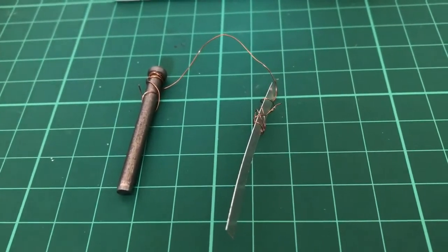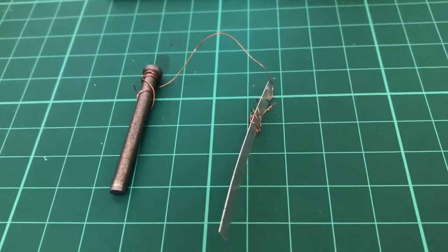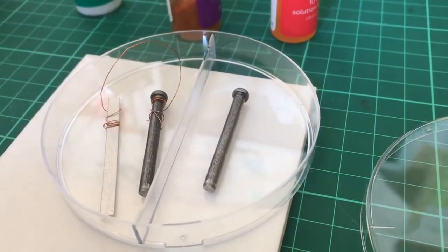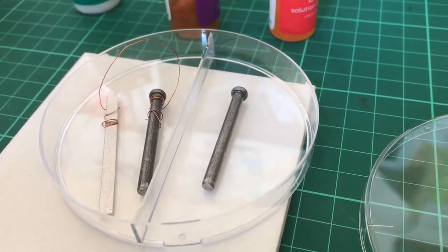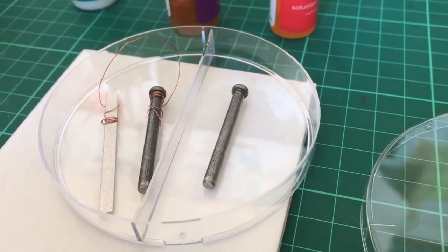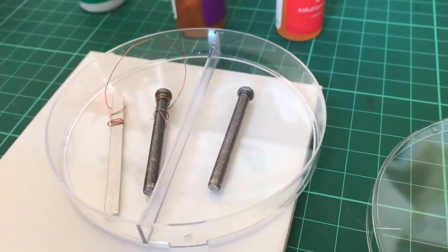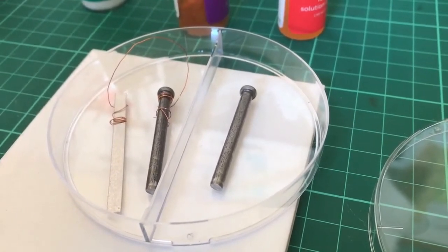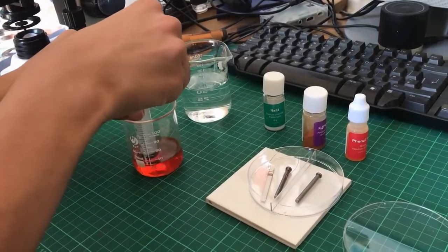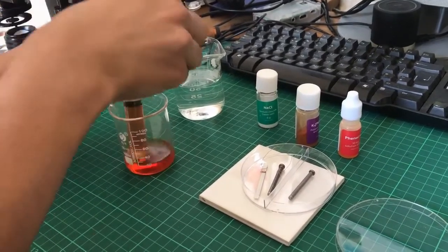We then place the iron-magnesium-copper arrangement on the left side of the petri dish and just an iron nail on the right. The iron nail on the right will act as a control experiment that will show what will happen if the iron is left to rust without any chemical intervention. We then add the salt and hexacyanoferrate solution to the petri dish until it completely submerges both nails.